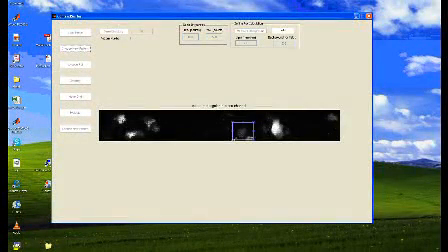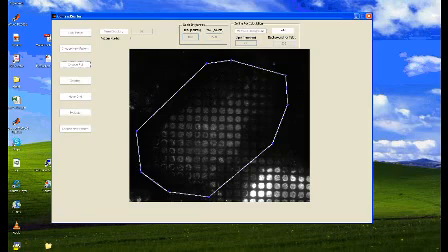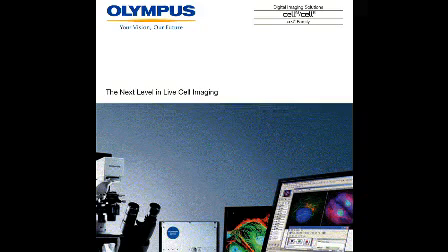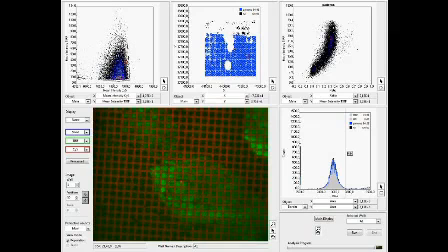For data analysis, we use a contrast calculation program written in MATLAB. Based on the fluorescence intensity within and outside the captured antibody region, the contrast level and thereby the degree of protein interaction is analyzed. For fast analysis of a great number of cells, also commercially available automated software can be used. For instance, the ScanR imaging software offered by Olympus has been successfully tested for the contrast evaluation of micropatterning experiments.